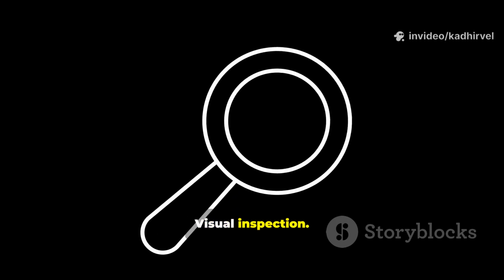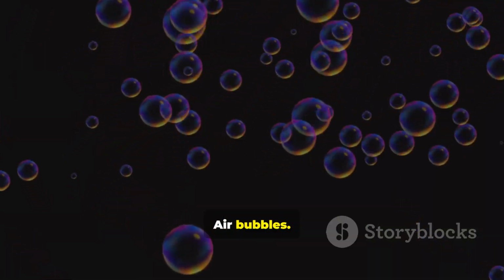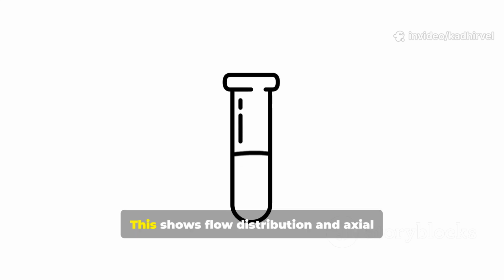Visual inspection. Quick checks include cracks, voids, air bubbles, channeling, and discoloration. Conductivity pulse test. This shows flow distribution and axial spreading, useful for large columns.